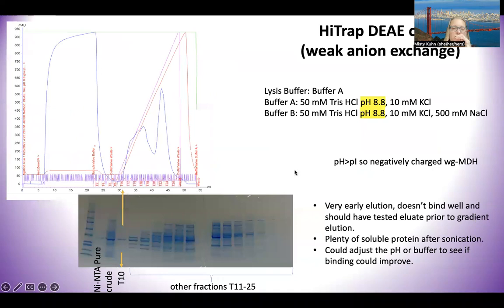What we did was, I'm just going to show you the results for all of the different groups, what kinds of data they got. Not because I'm trying to explain that this is the best technology, but to show you the variety of the results and the ability to leverage this to teach them a little bit deeper about how protein purification works.